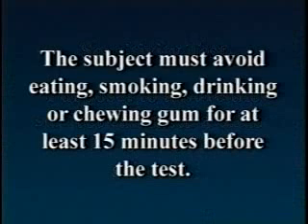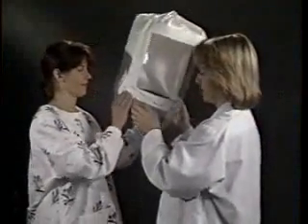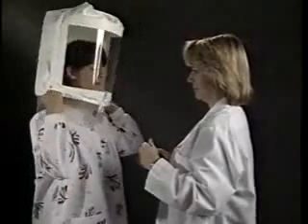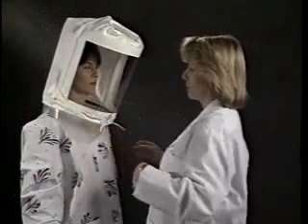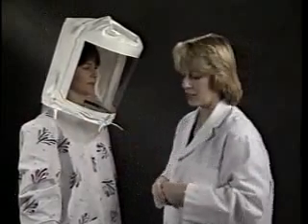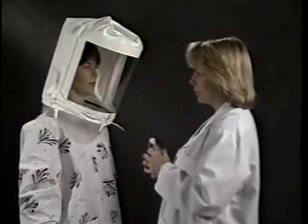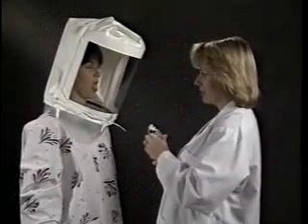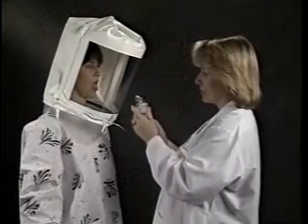The subject must avoid eating, smoking, drinking, or chewing gum for at least 15 minutes before the test. To conduct the sensitivity test, first instruct the test subject to place the hood and collar assembly over their head without a respirator. Position the hood assembly forward so there is about 6 inches between the subject's face and the hood window. Instruct the test subject to breathe normally through the mouth with the tongue slightly extended.